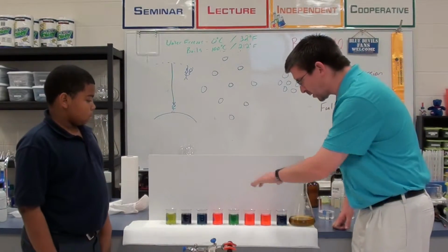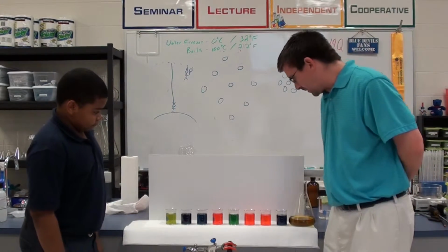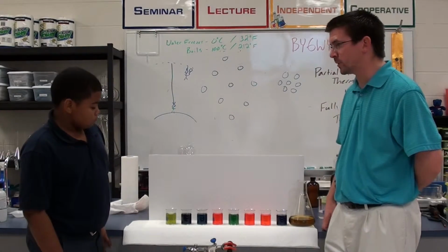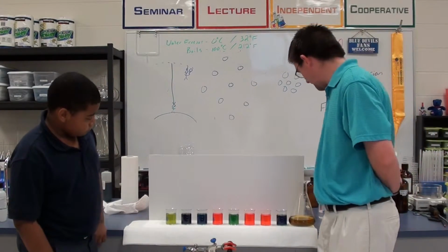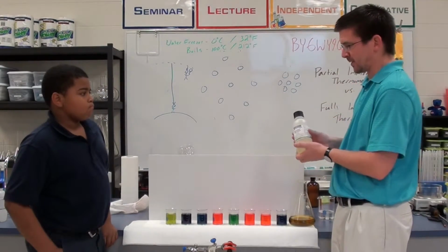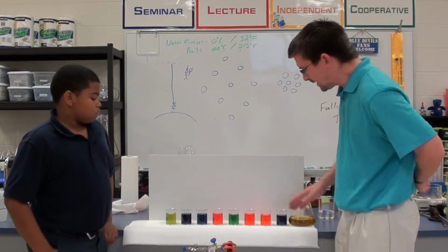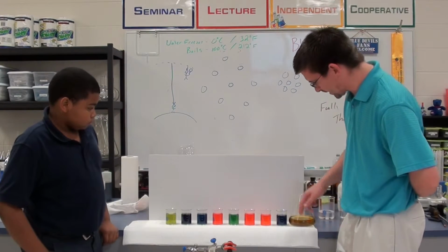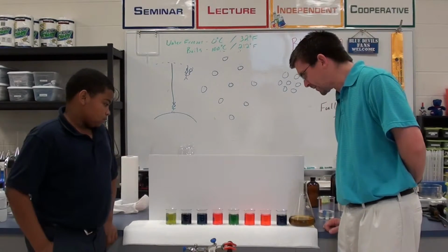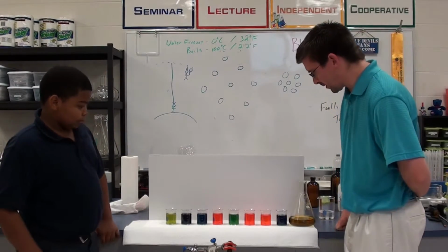So we had a little bit of liquid already in here. They weren't empty beakers. You had a little something in there when we started pouring. But each one changes color based on the pH of the chemical that was in the beaker with it. Some of these are just called buffer solutions. They're made to be a certain pH. This is a pH 7 buffer solution. We had like a pH 1 and a 4 and a 10 and different buffer solutions. And there are also things like egg yolk, which is a base, peroxide, which is a little bit acidic. So we have a nice range of colors based on the pH of the liquids that are in there.